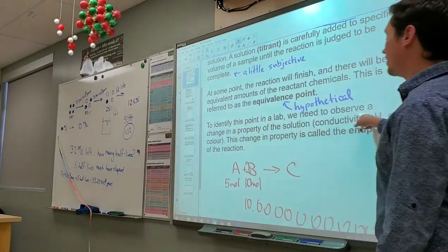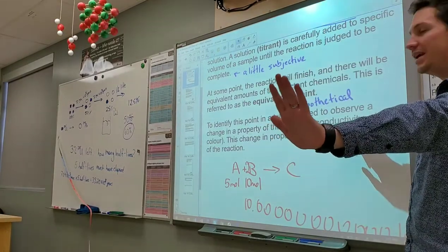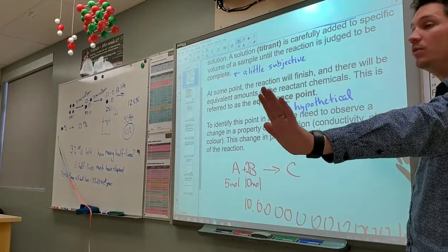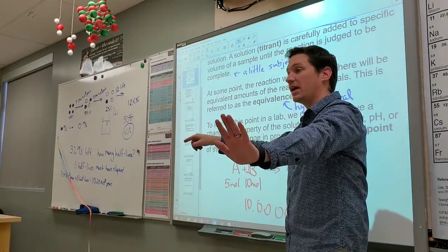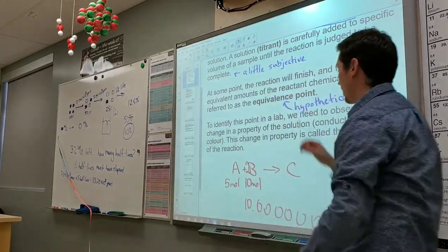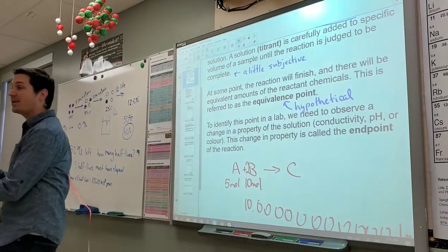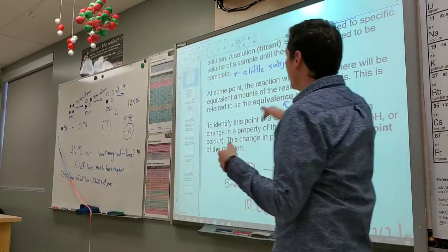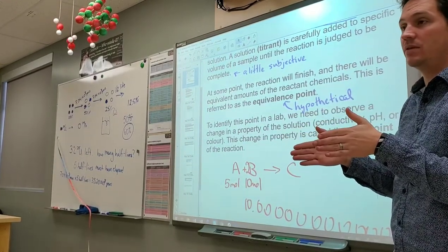To identify this point in the lab, we need to observe a change in property of the solution. Now, we can observe lots of properties. We can see when it starts to conduct electricity, or maybe when it stops conducting electricity. Maybe we can stop at a very specific pH, or maybe we want to stop at a very specific color, okay? But can you see how color is a little bit subjective, right? This change in the property, when it went from blue to green, we were supposed to stop at green, right? That was our end point. The end point is what you observe in the lab. The equivalence point is the hypothetical point that you're trying to stop at, but it's not possible. So just don't worry about that.